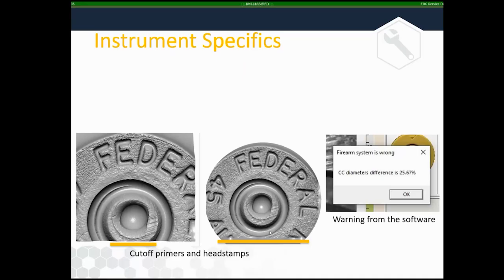Instrument specifics, we could talk a ton about this. I will just go ahead and mention to you that it's really important to think about what you're putting into your instrument and what you're telling the instrument that you're scanning. A lot of us think that we have a 3D scanning instrument, so it should be able to scan anything I put into this sample holder. I'll just throw it in this instrument and it'll make this beautiful image for me.